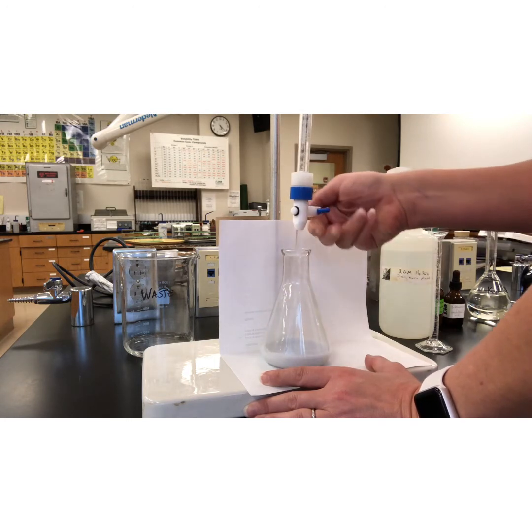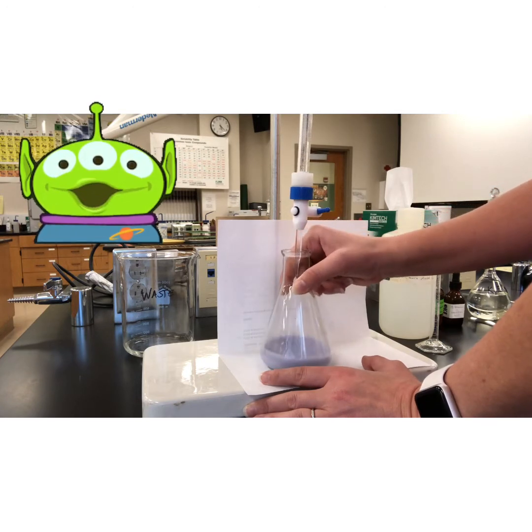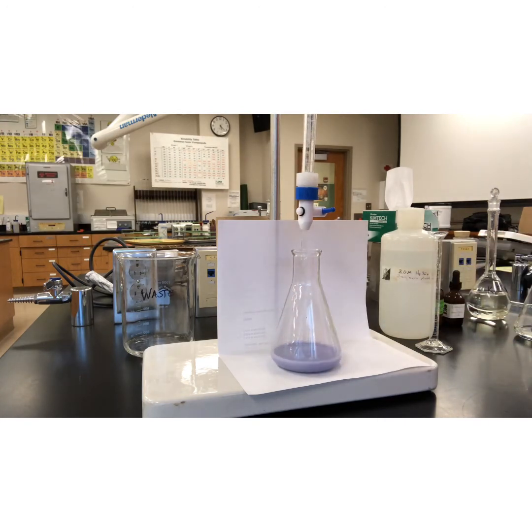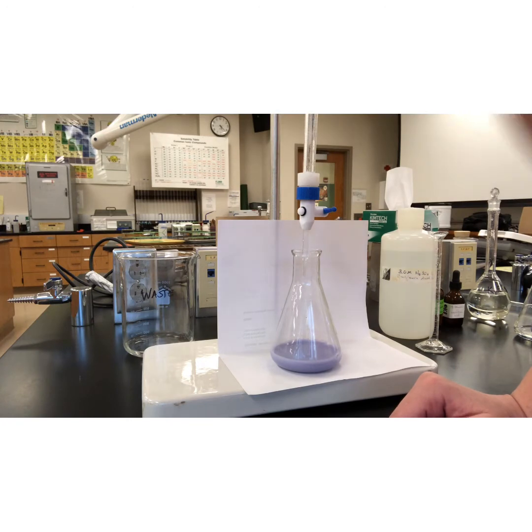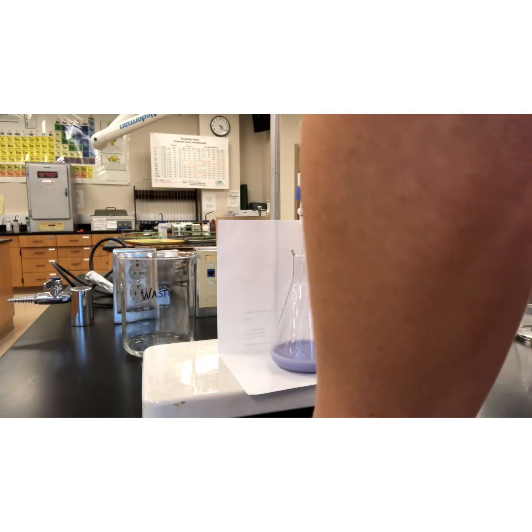Ooh, there we go. Look at that. Let's see how much more we added. So we had a huge color change. But I would say I'm going to change that endpoint volume to this one, because it did take quite a few more drops, just not a drop or two.